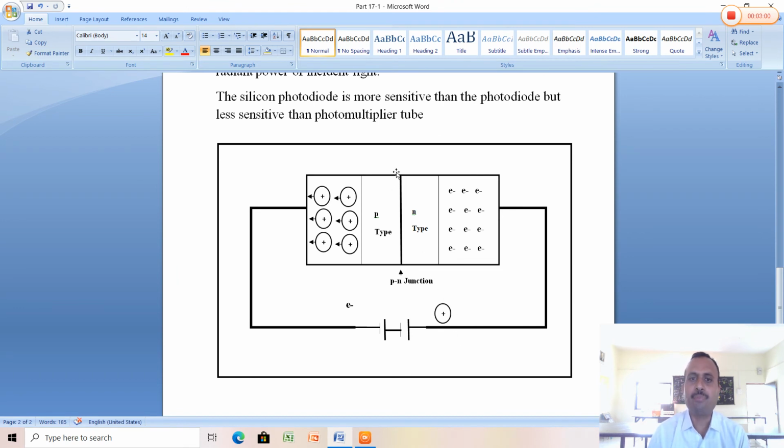When a proper voltage is applied, the PN junction or depletion layer gets distorted and widens, and a proper width is observed in the depletion layer. The proper width observed in the depletion layer is directly proportional to the transmitted amount of radiation on that depletion layer.